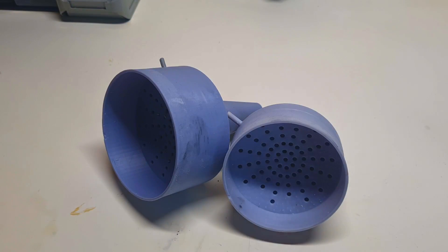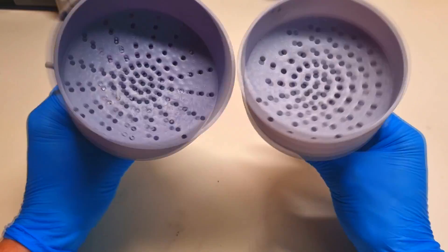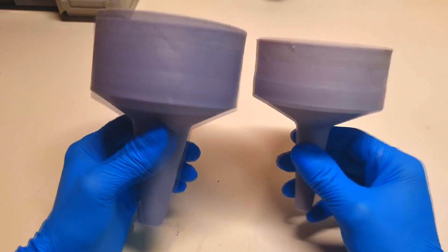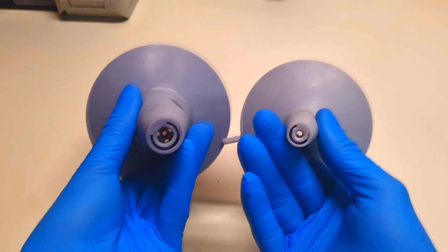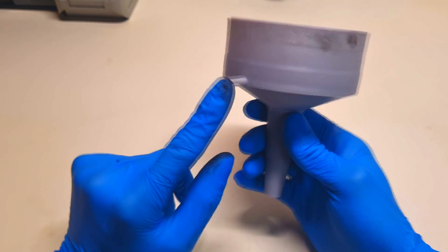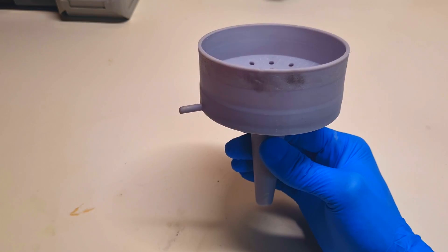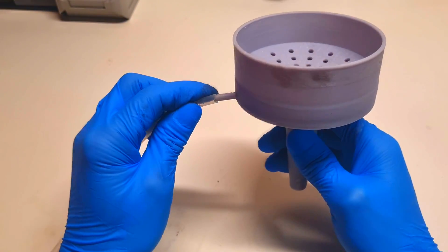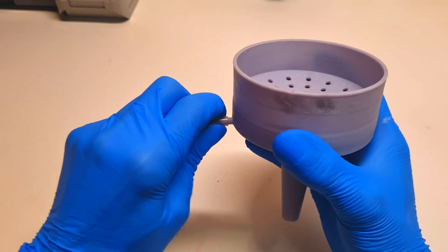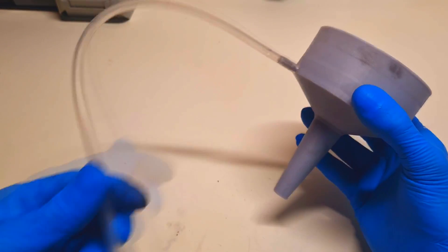After printing with the resin printer, I made myself two vacuum filtration funnels in two different sizes. Here I can connect a silicone tube with a hole diameter of four millimeters, like so.